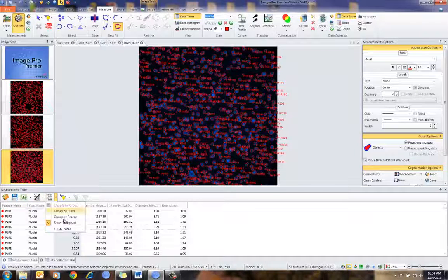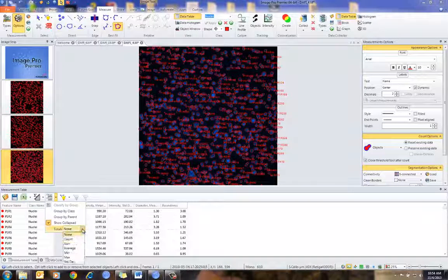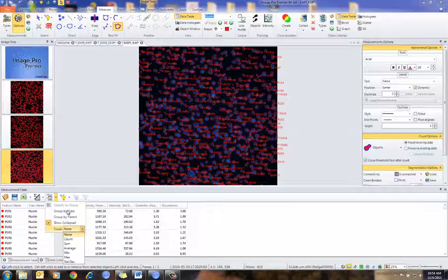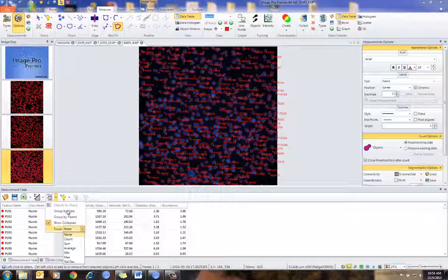I can choose to group the data in various ways by class. In this case, I only have a single class of Nuclei. If I had multiple classes of objects — positive, negative — I can set that up to display everything by the proper class.